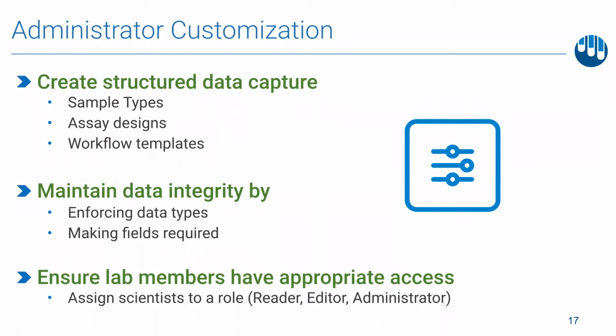This includes customizing the fields captured in different sample types and experimental assay designs, as well as creating defined tasks and workflow templates. All of these data types follow a similar design interface, making administration easy to learn and adopt. In each of these designers, managers can enforce the data type of each field, as well as determining what fields are required versus optional.